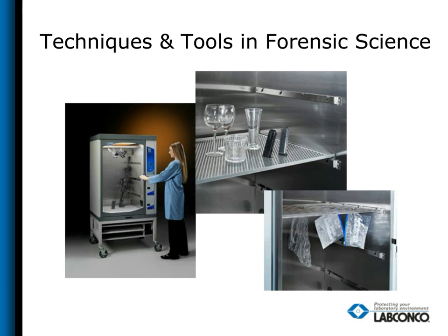You have different types, different sizes, different brands. Some of the best ways to sort these out is to take that actual square footage and divide it into the cost of the unit so you can actually figure out what your cost is per square footage. That gives you a baseline to compare different types of systems. How many shelves, bracket holders, things like that do you have to allow you to move evidence throughout the system so you can maximize the different cycles?